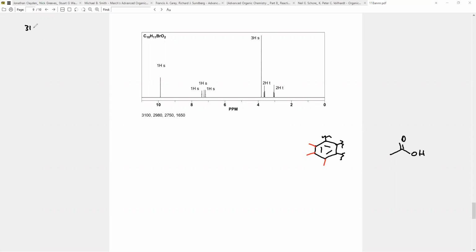So whenever you have three hydrogens in your benzene region, here are the different types of patterns. I'll try to put these in an order from easiest to hardest to see, so that you can do the easiest ones first. But the easiest one to see is when we have this sort of pattern here.